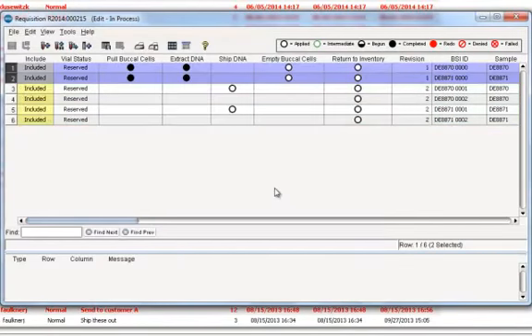The process task has been completed, and the ship task is automatically applied to the DNA specimen with the sequence 0001, and the empty task is automatically applied to the buccal cell specimens with 0 volume. Now I will complete the ship and empty tasks.